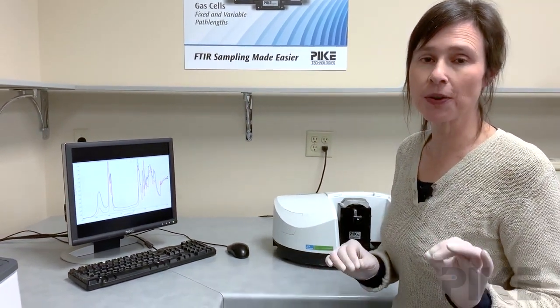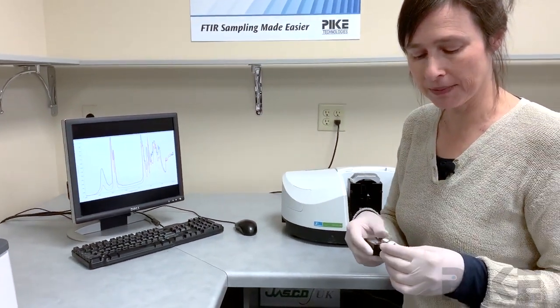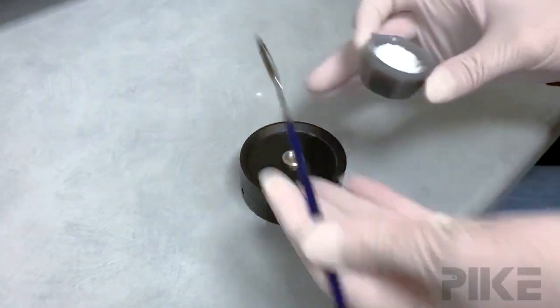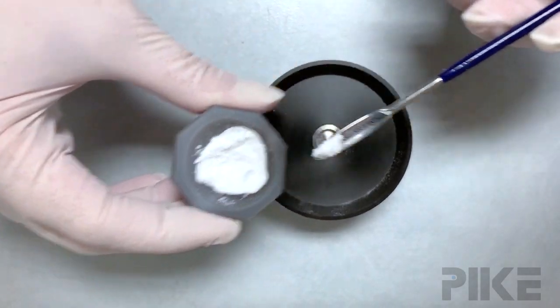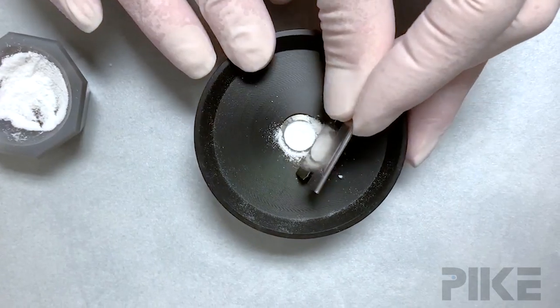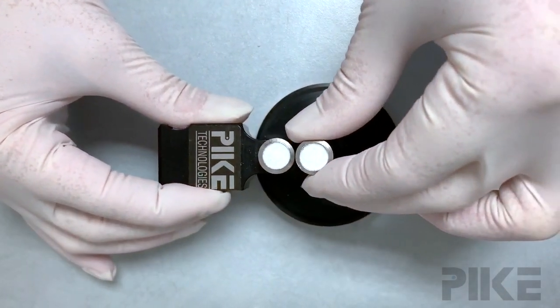Today we're just going to focus on how I load a sample cup. These are typical sample cups and we're going to load one right now. This is just a little tool to catch any overflow. I just loosely pack it into the cup and once I'm done I'll strike across the top with a razor blade. Now my sample's all set and ready to be loaded.